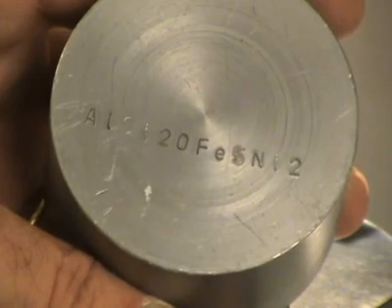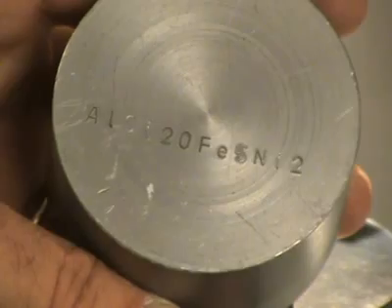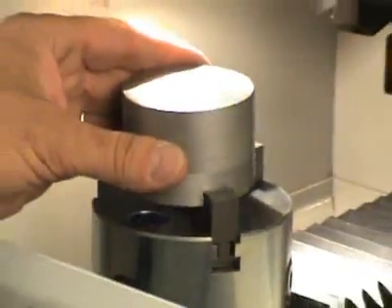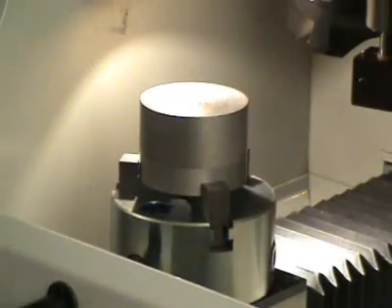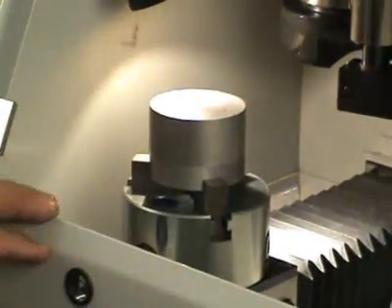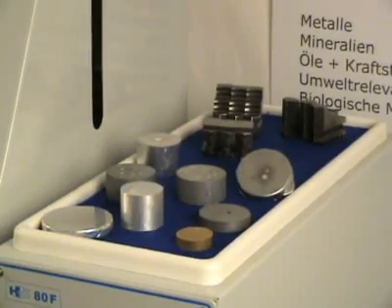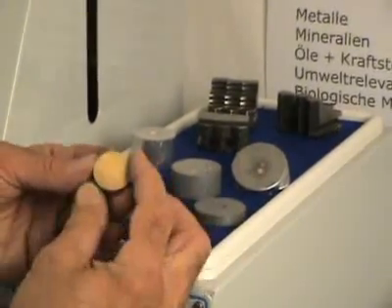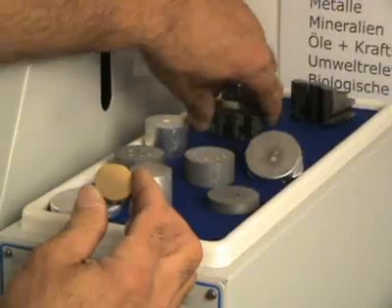Here you see a big piston alloy sample of approximately 70 millimeter diameter. For fixing such a sample, so-called reverse brackets are supplied as standard accessory. And here you see a variety of samples of different dimensions.